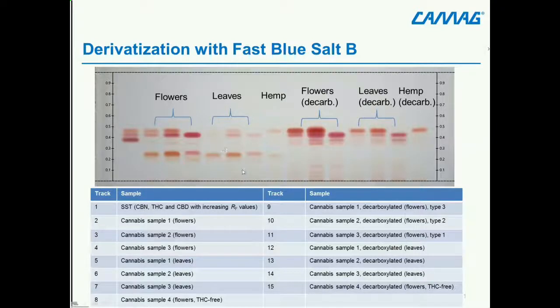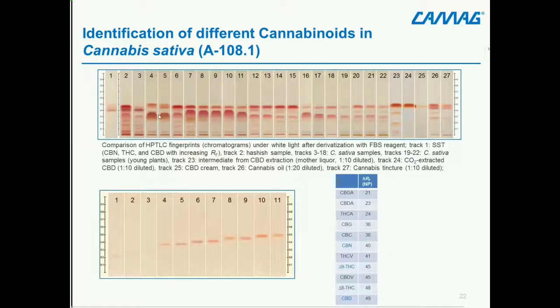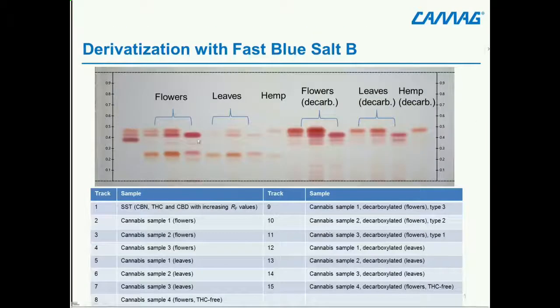The cannabinoid acids can be analyzed with this straight phase separation, which is beneficial if you want to have the whole sample composition. And the decarboxylated samples are for when you're just interested in the cannabinoid itself. So if you're interested in THC content, then maybe it's easier to decarboxylate them and just analyze the one target instead of having the two standards and two calibration curves. But it depends on the analytical goal.